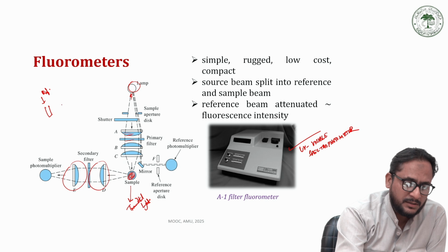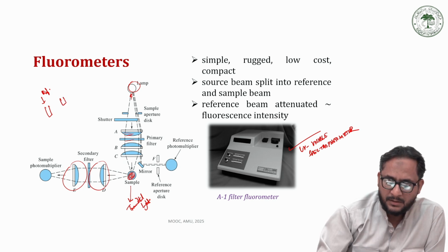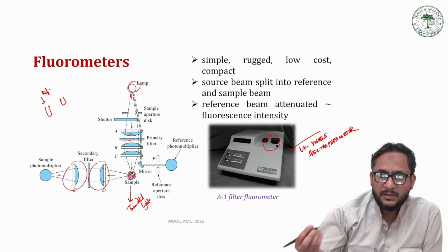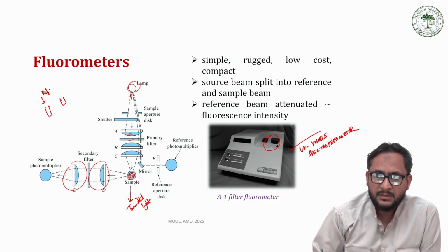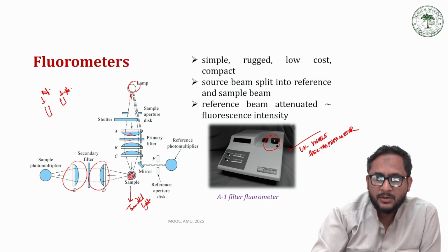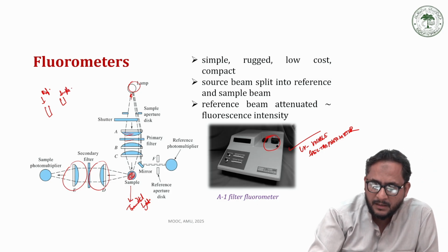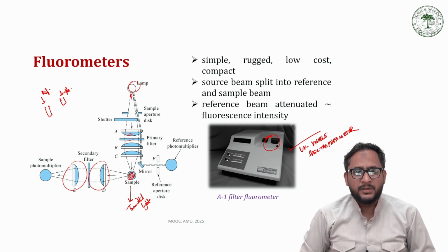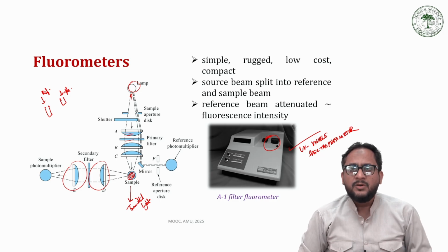Then in the second case we again open the cover of the machine, remove the cuvette, wash it, then fill it with sample, put it inside, close the cover of the machine, and allow the light radiation to pass through it to create another spectrum for the sample.